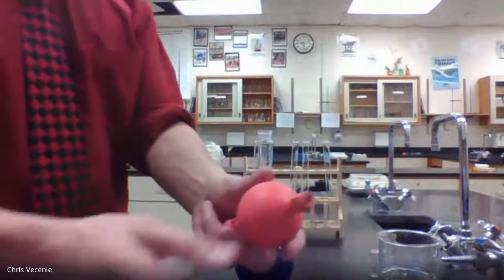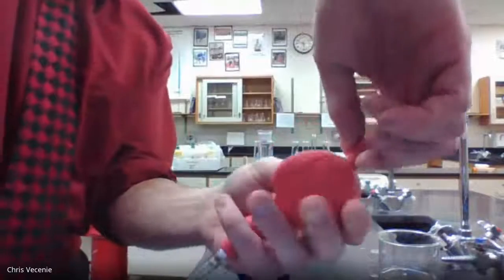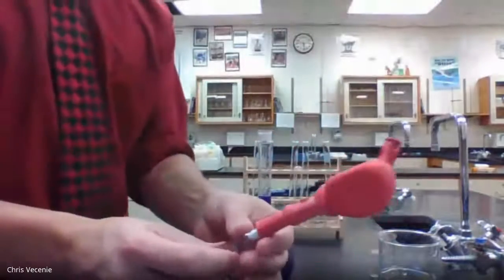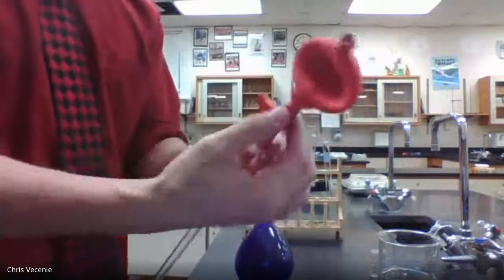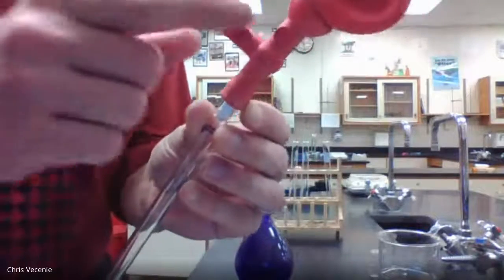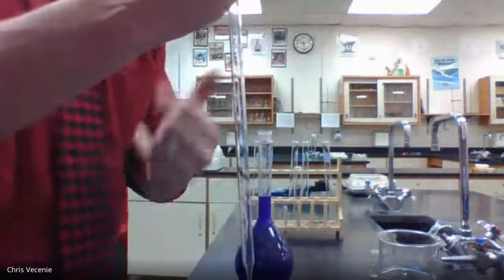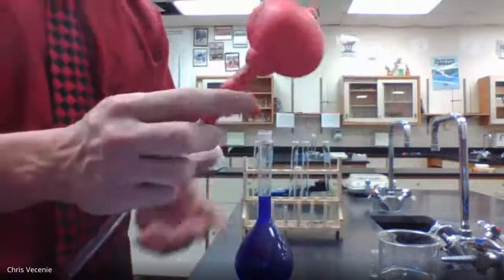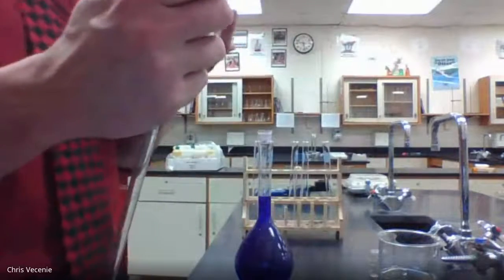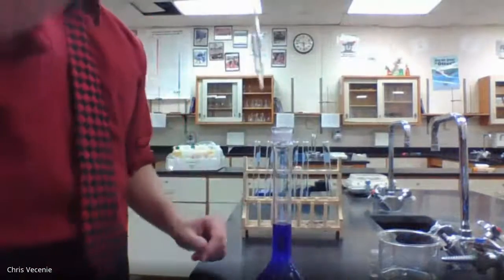take this bulb at the top, and you push down on it, and you push a bunch of air out of it. Right? That's going to allow you to create a vacuum up in here. All right, so when I push on this button here, right, it's going to draw a solution up into the pipette. And then when I hit the button here that says E for expel, I can transfer it where I want it to go.